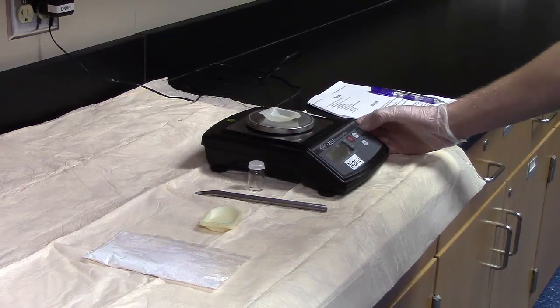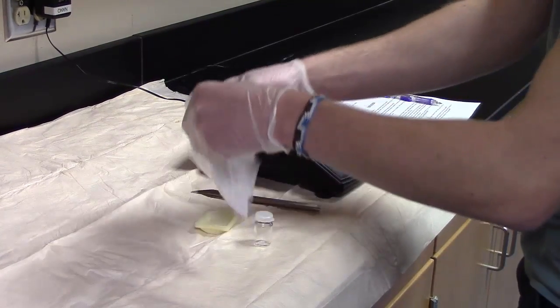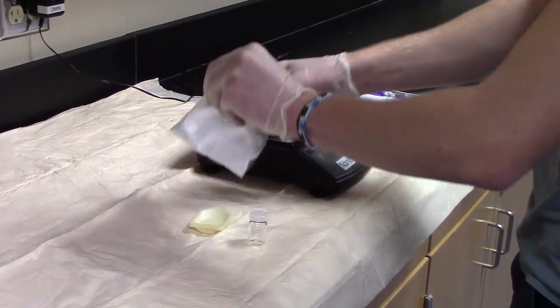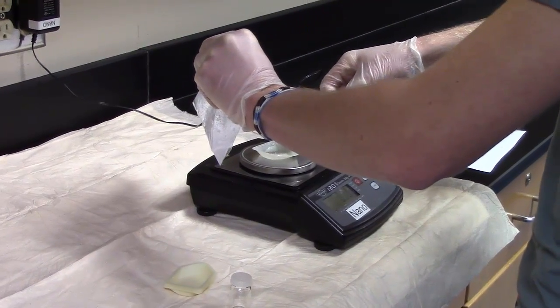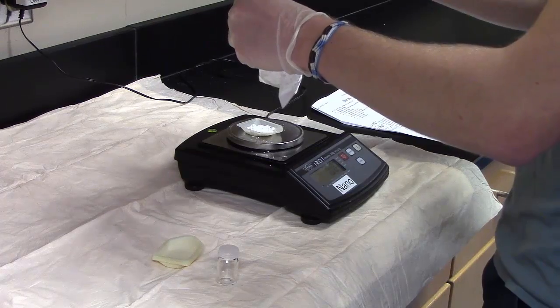Next, place a weighing bolt on the balance and tare the balance so that it reads zero. Open the sealed snack bag and use the scoop or spatula to place about 0.99 gram to 1.01 grams of the glow germ powder into the weighing bolt. Re-seal the snack bag.